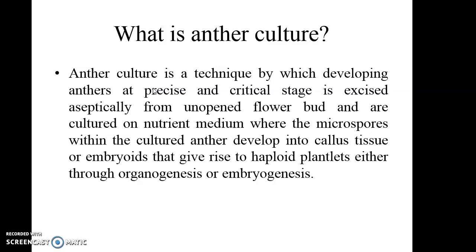How can you select? Take one anther and press it, so that the microspores or pollen grains present inside the anther come out. Then stain that pollen grain with acetocarmine, and you will come to know the stage of the pollen grain, and according to that you can select the anthers.